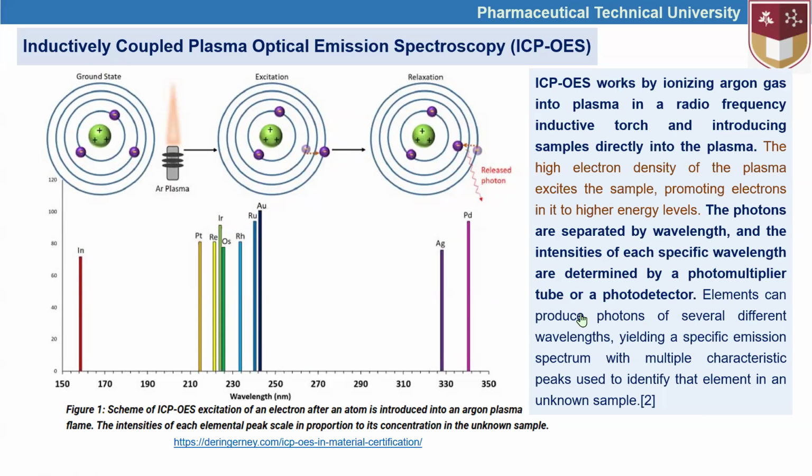The term is ICP-OES. The full name is inductively coupled plasma optical emission spectroscopy. This is a tool which is widely used in food analysis. In food analysis, it can be effectively used, and it can identify the presence of atoms, not only the presence of different metal atoms, but also the quantity of those atoms, even if they are in trace amounts.